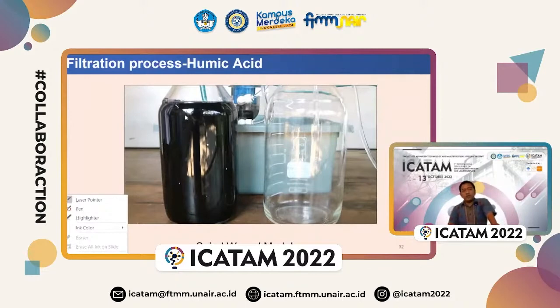It's a movie of a small experiment we are doing. We have a humic acid solution here, and we use the spiral module on the back. We draw it using a pump, and then the water is coming out here, and we get clean water here.